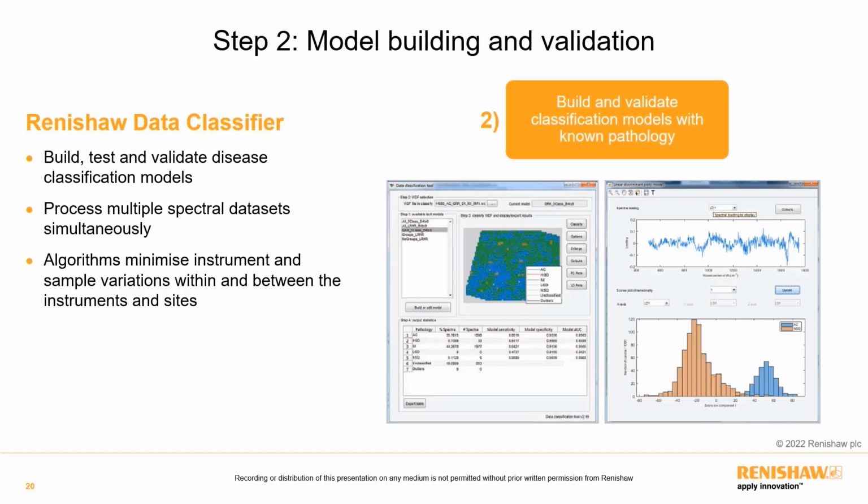The algorithms used in the data classifier actually take into consideration any instrumentation variations and have algorithms to automatically deal with these to ensure that samples are not misclassified on this basis. The data classifier is based on PCA-LDA, which we discussed previously, and that is a multivariate data analysis technique.